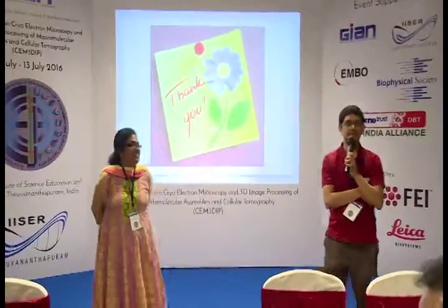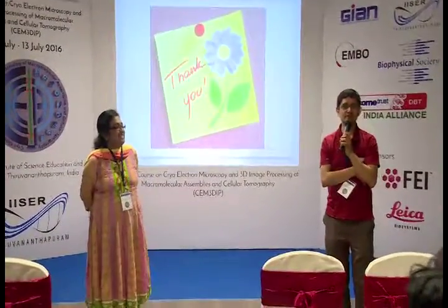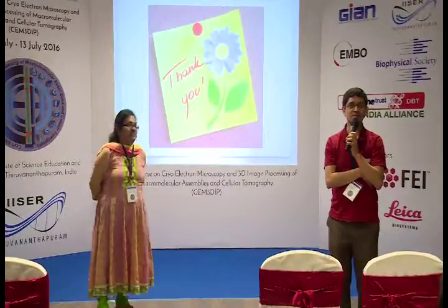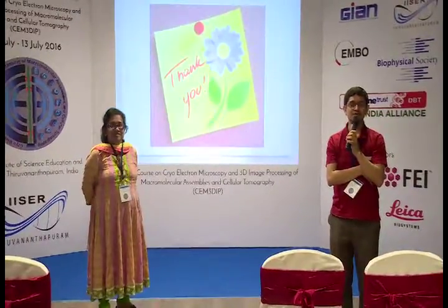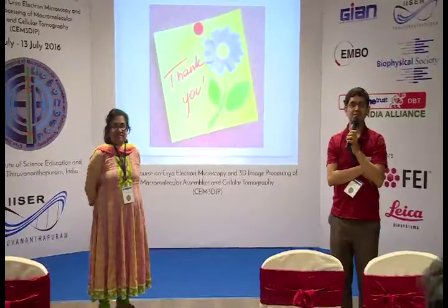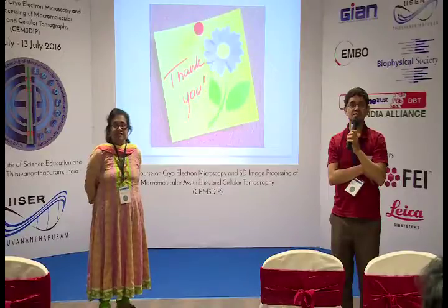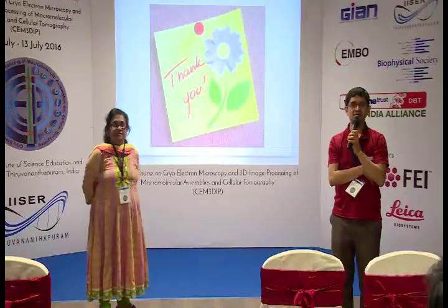I just wanted to ask, maybe there are other factors like goodness of fit in crystallography. How do they differ from cross correlation? Is it very close, or does goodness of fit depend on how you define it? Yes, okay. The classic way of goodness of fit is a difference divided by variance.